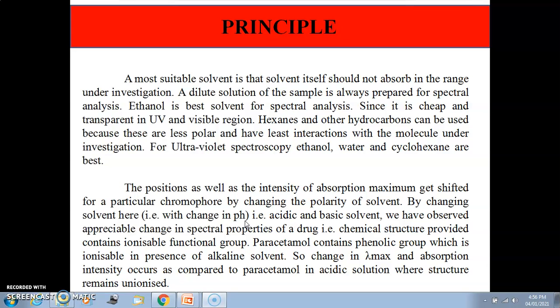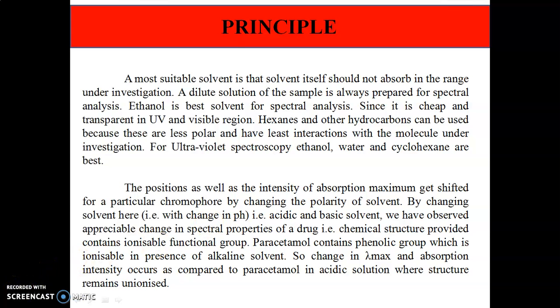In a polar solvent, hydrogen bonding forms a solute-solvent complex, and the fine structure may disappear. The third criterion is that it should be less polar so that it has minimum interaction with the solute molecule.